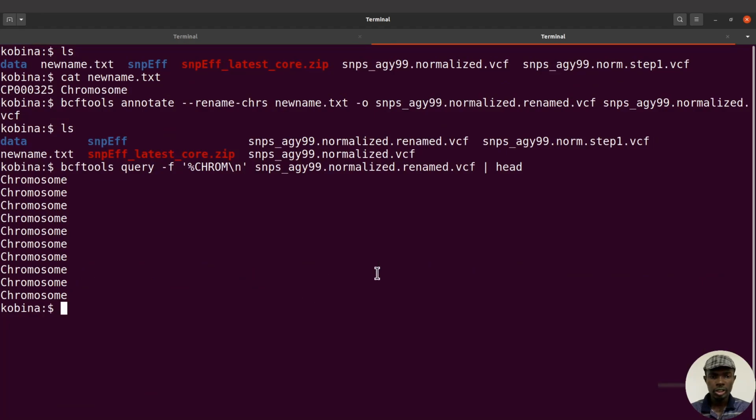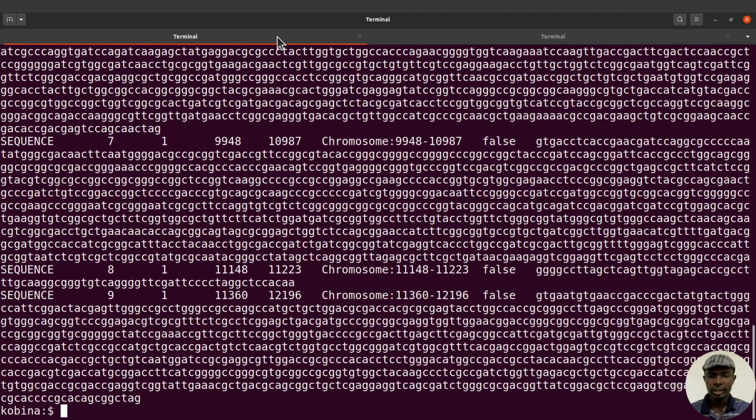Okay. So this is what I want to do. I'm now going to rerun snpEff again, and then get the command. Okay, running. So I repeat, I'm now going to rerun snpEff and then get my variant effects predicted for me.